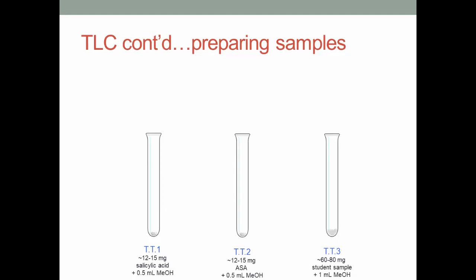Then, add half a ml of methanol to test tubes 1 and 2, and 1 ml of methanol to test tube 3. And mix well.